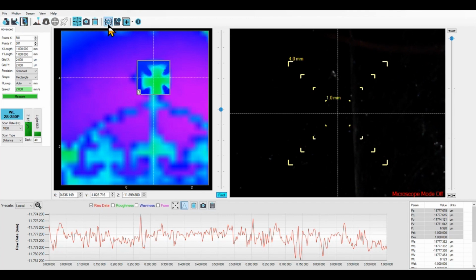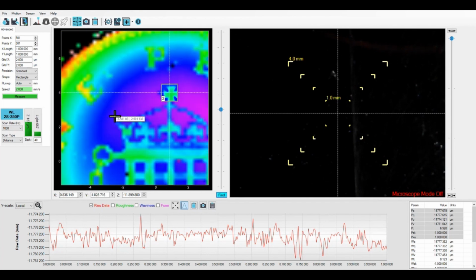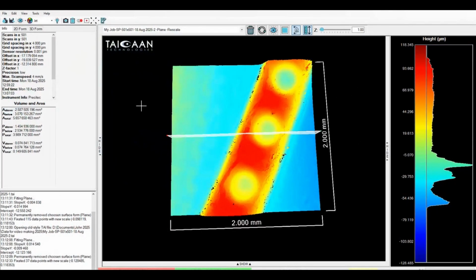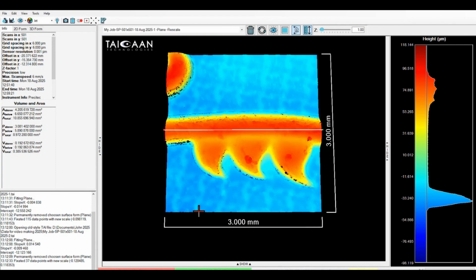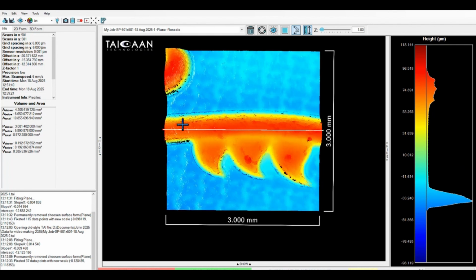What we're now going to do is use the BEX software, which is shown in the window here on the top left. I've actually already preloaded the 1st and 2nd measurements into BEX. So I'm just going to share that screen now. So here we have the 1st measurement. The 1st measurement was an area 3x3, and we can see a lot of data now on the surface. It's a sharp 3-pointed feature here on the top surface of the coin.